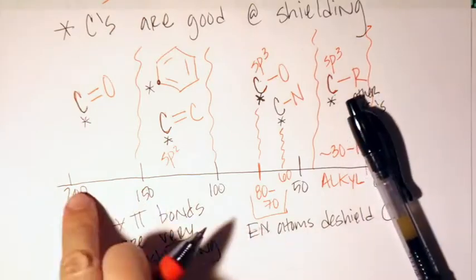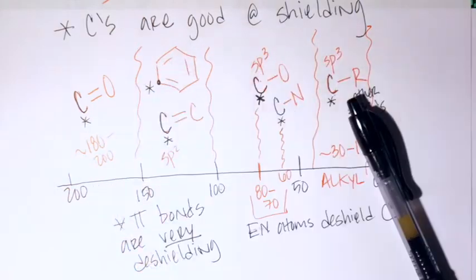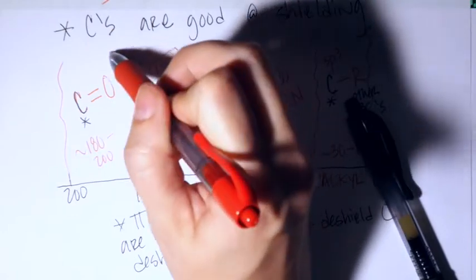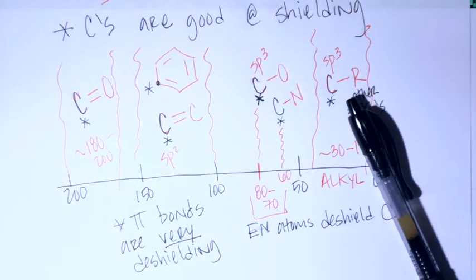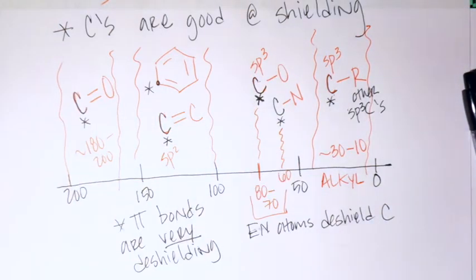Those carbons are going to show up down here in the roughly 180 to 200 region. Those ones are pretty distinct because nothing else shows up down here. Those are the only ones that you're going to see down there. So if you see that, you get the idea that you have a carbonyl. And of course, a lot of this you're also going to see in your IR. So when you take an IR and an NMR, you can combine the two pieces of evidence to really say what's going on in your structure. Those are the main regions for that.